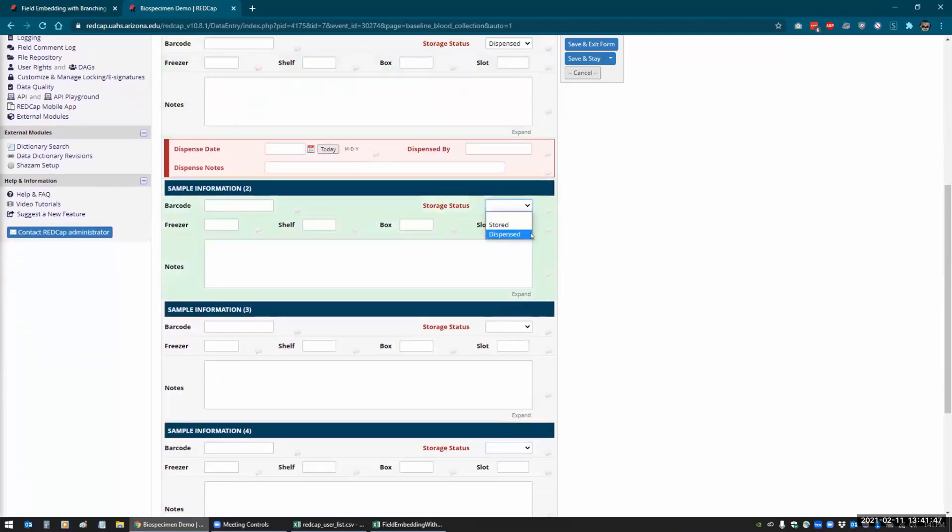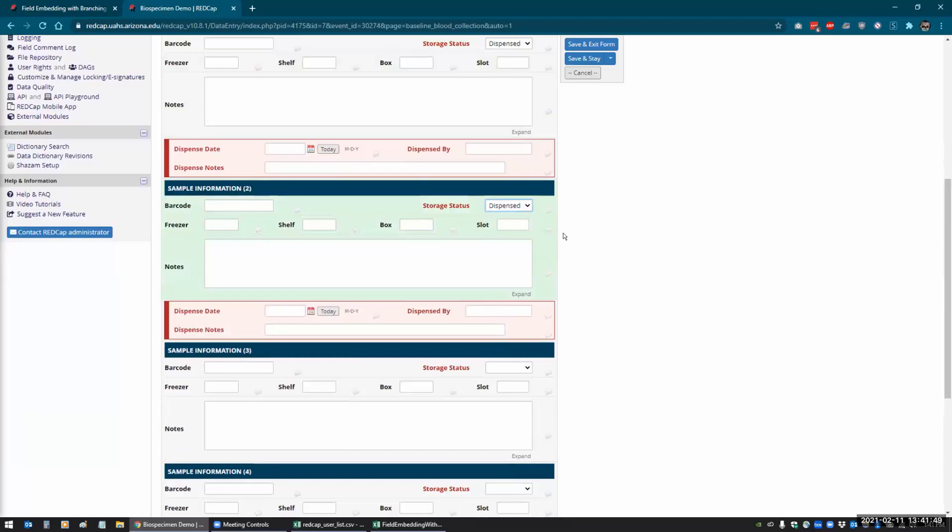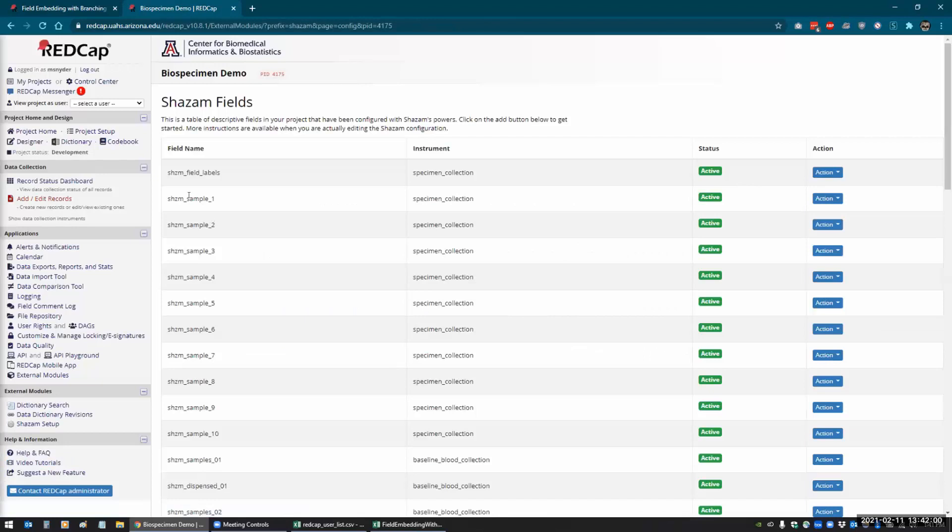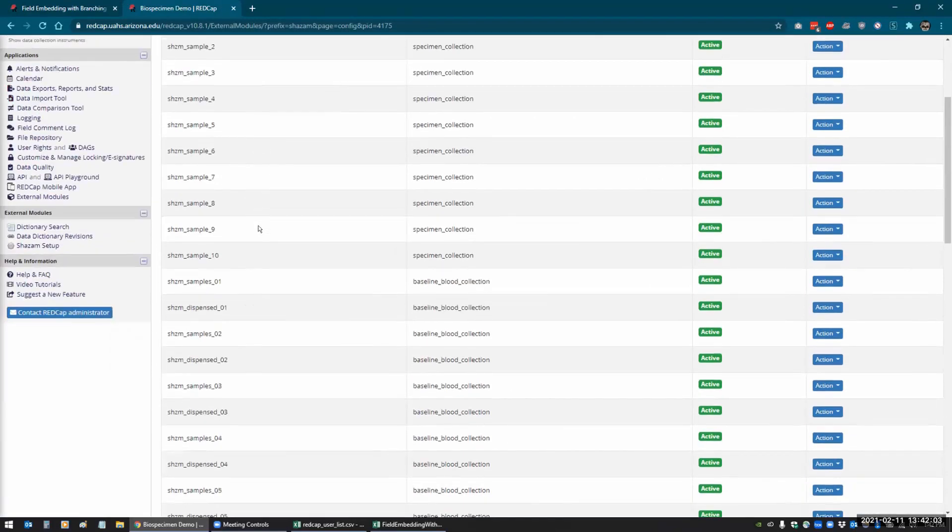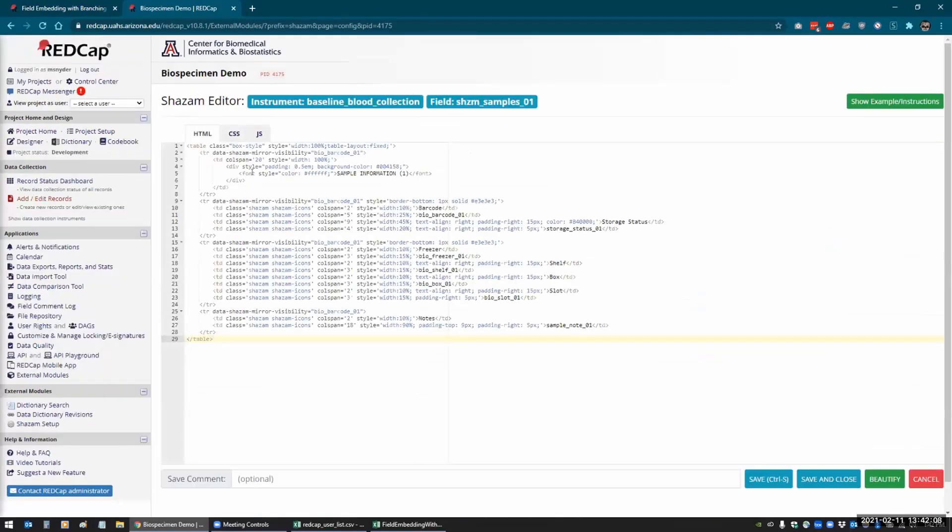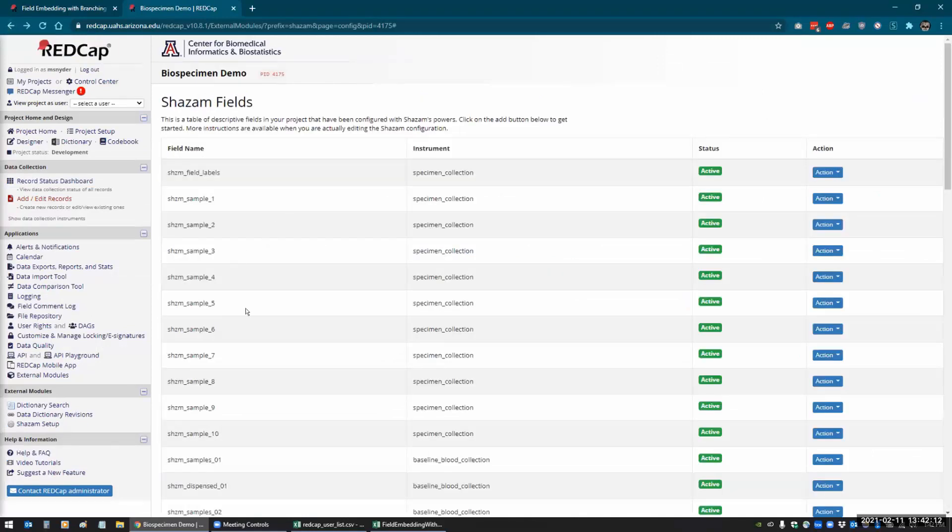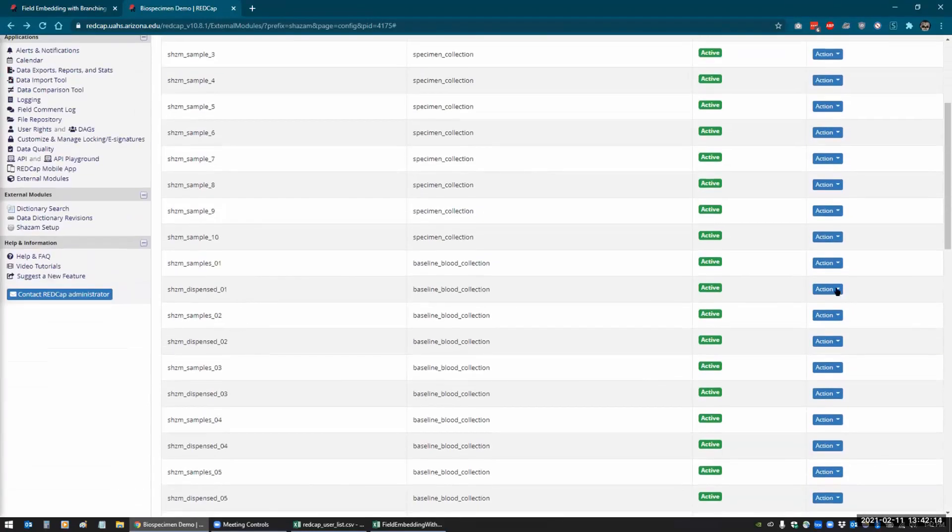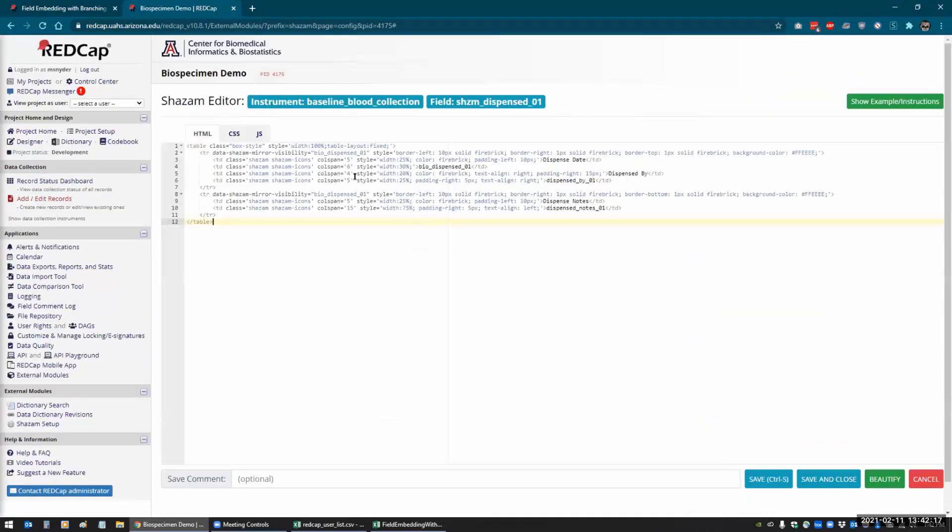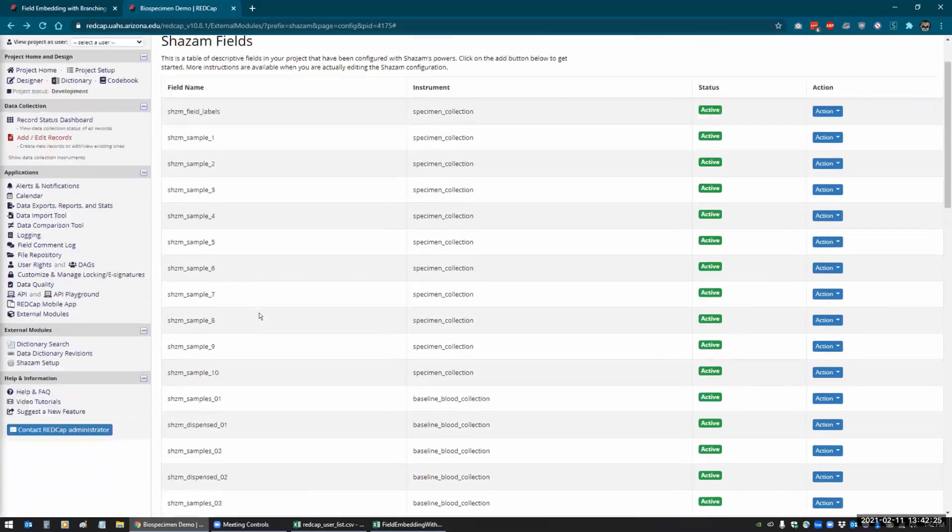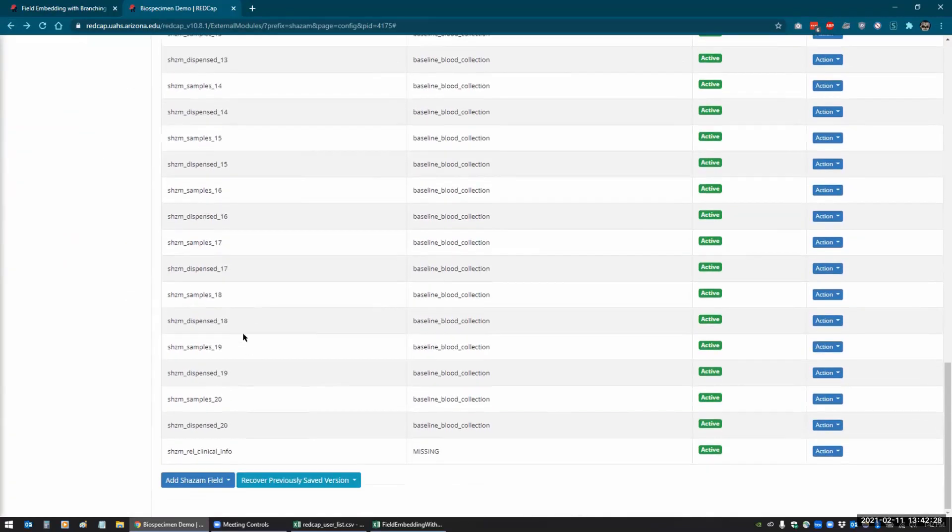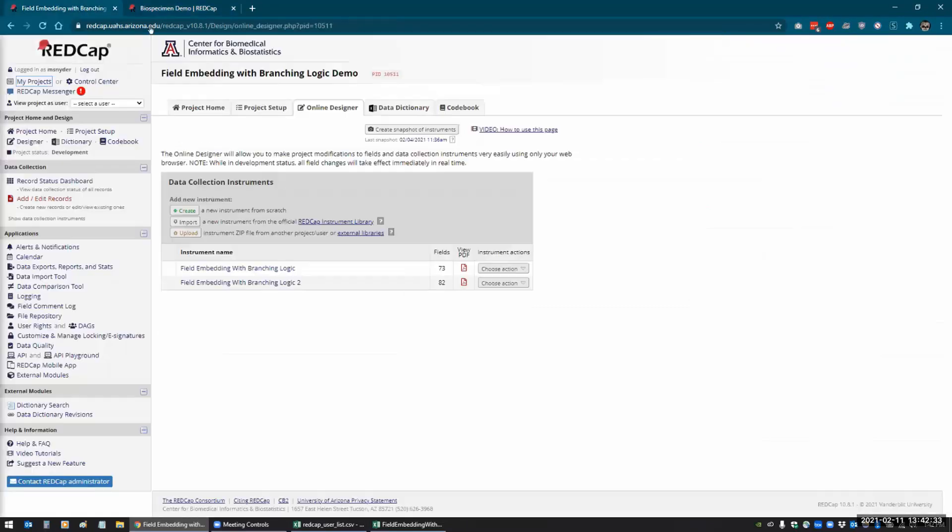And I did this using Shazam, and it was very complex because with Shazam I had to create a Shazam field for each one of these. So samples one, I had to create that with all the HTML to display those fields, and then I had to do the same thing for the little dispensed window that pops up. They wanted 20 samples, so that's 20 copies of each one of these. You can see here that it goes all the way down to 20. So there's like 40 of these things.